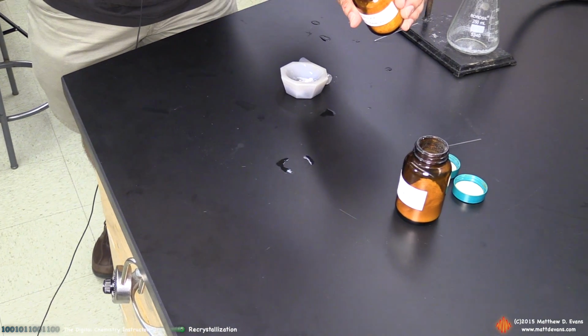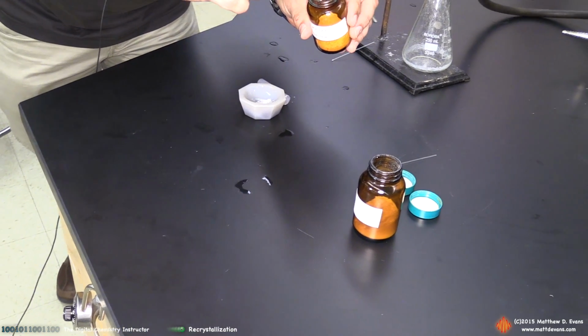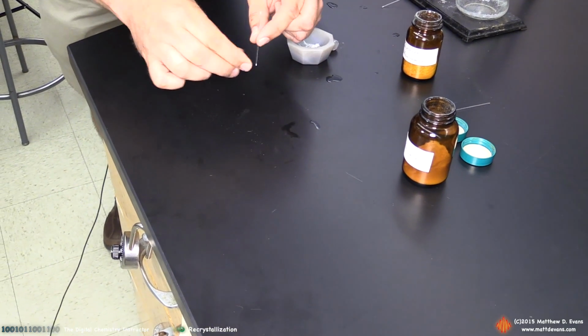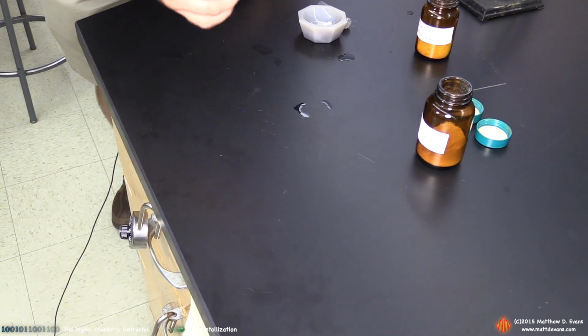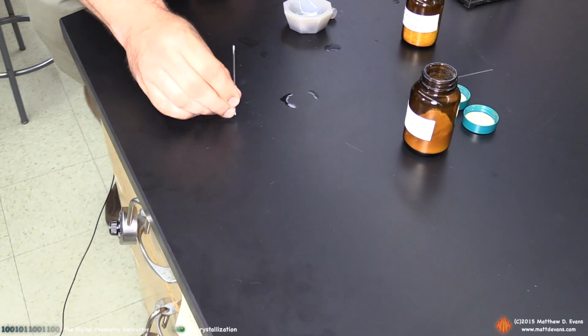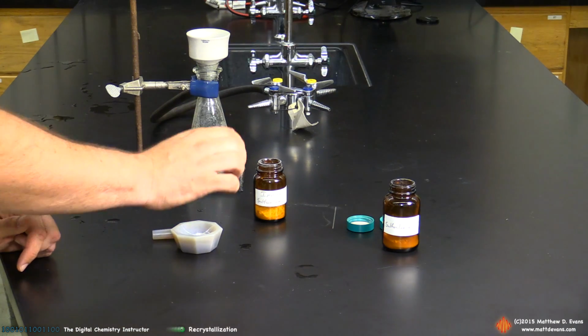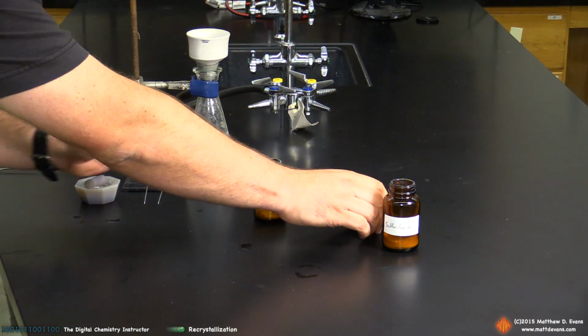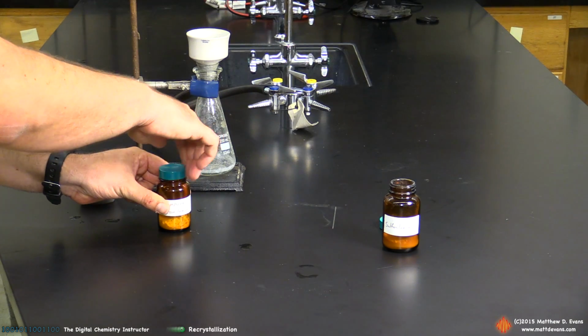No, looks like I didn't get any in there. There we go. Again, make sure it's firmly packed into the bottom. So this one's going to be our impure. To keep track of this, I'm going to put this mortar and pestle here. I'm going to put the impure in the middle.